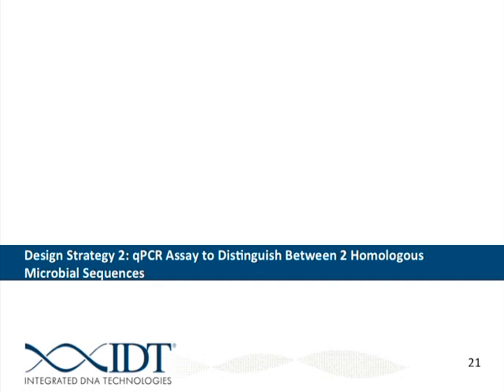All right, so a second design strategy. Now for this one, I won't step out and do everything. We've already kind of showed how to put the sequences and align them in Clustal and use some of the programs. But if there's anything you want me to step out of PowerPoint and demo live, please let me know and I can do that. Otherwise, we're just going to go over a couple other design scenarios and the process that we would go about to design for these different considerations.